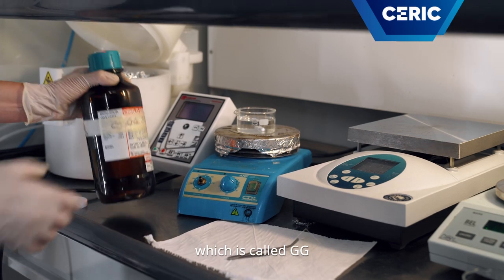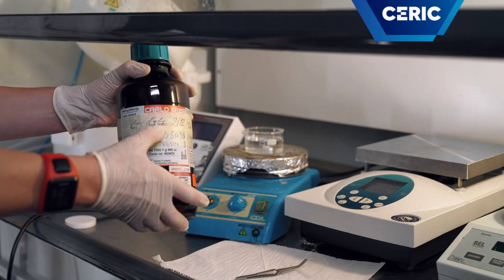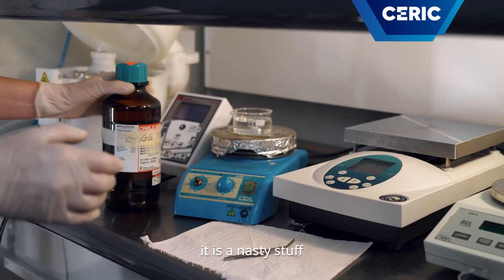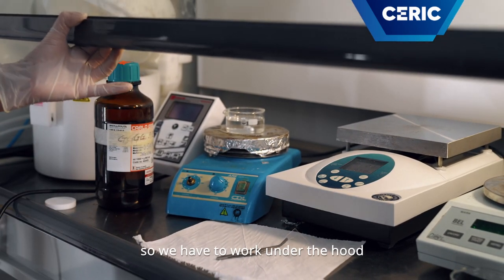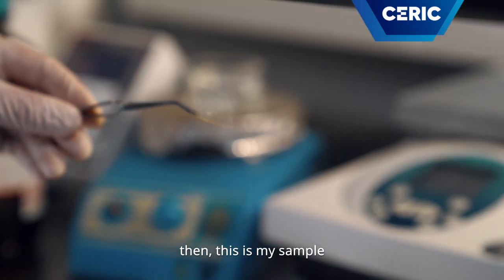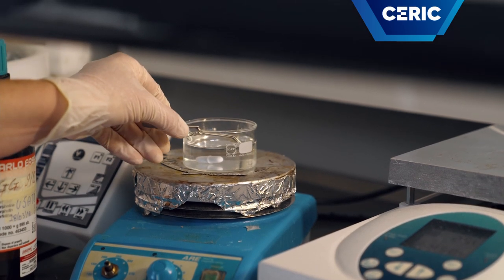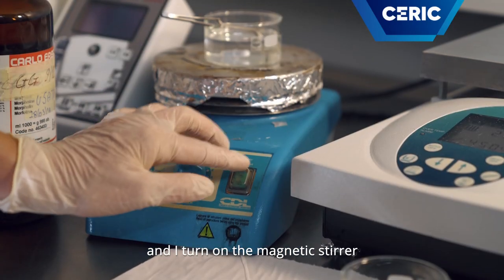which is a composition of many chemical agents. It's nasty stuff, so we have to work under the hood. I put the sample in the bath and turn on the magnetic stirrer.